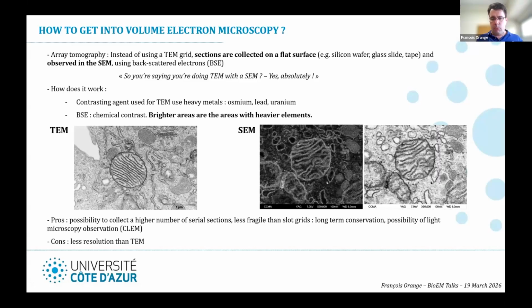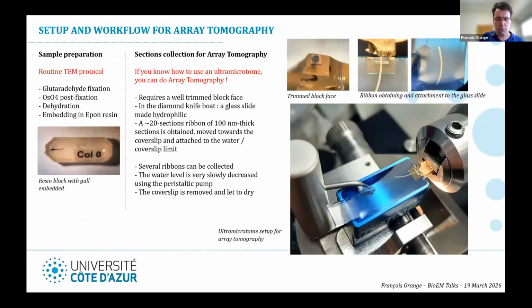So you can collect a higher number of sections, as I said, and you can keep them. The problem is that you won't have the resolution of the TEM, but you won't be that far, actually. On the next slide, I will describe my own setup for array tomography. And I will also stress at several points that all this is accessible, because all the steps are quite simple.